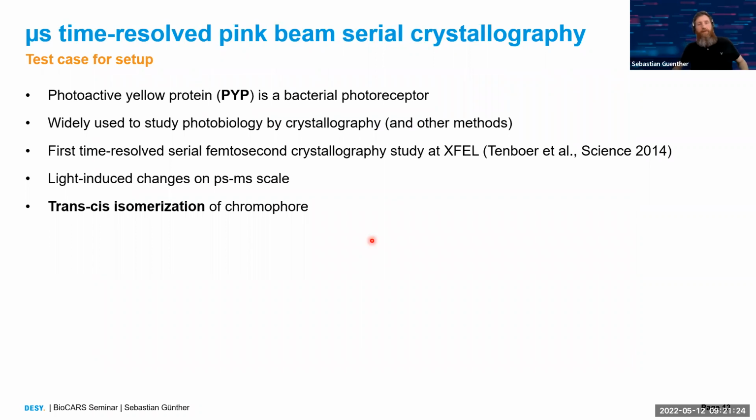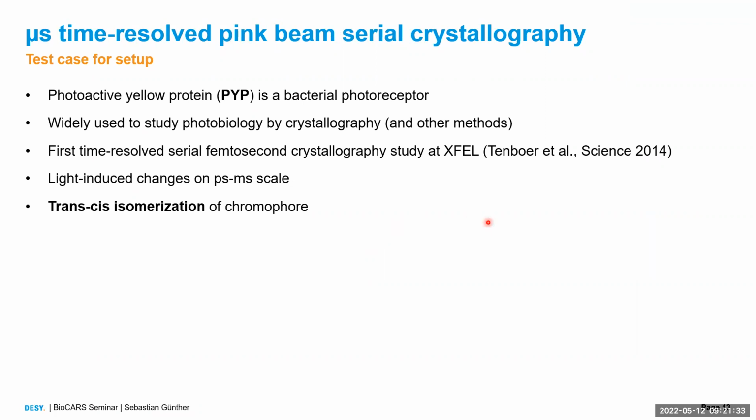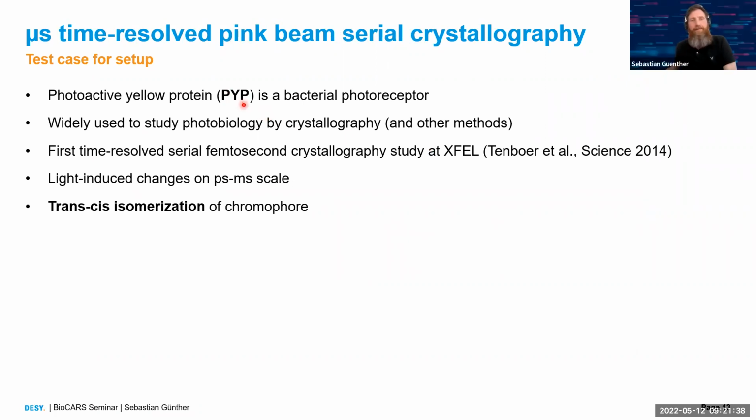Okay, so I'm coming to the first experiment, one of the first experiments we did for pump probe experiments. This was done at BioCARS. Here we used photoactive yellow protein, one of the guinea pig crystals for crystallography, or time resolved crystallography. It's actually the sample of the first femtosecond crystallography study done at XFELs.